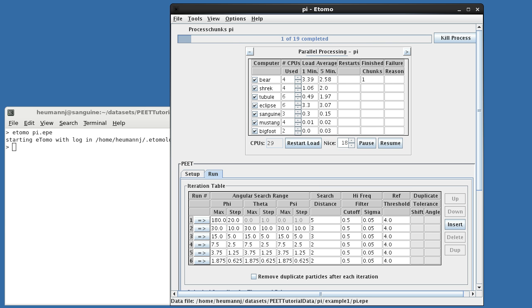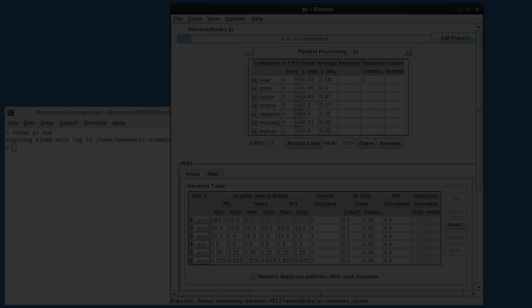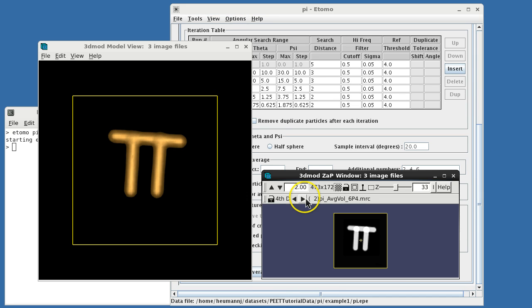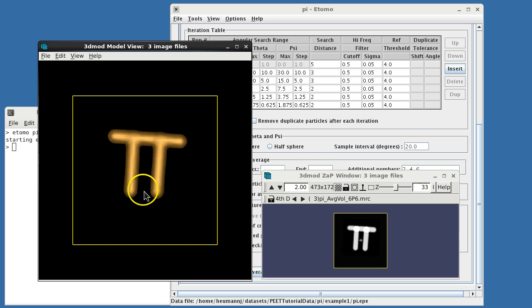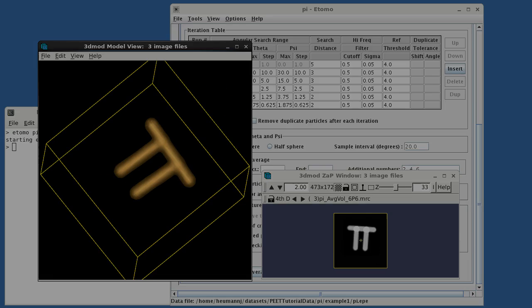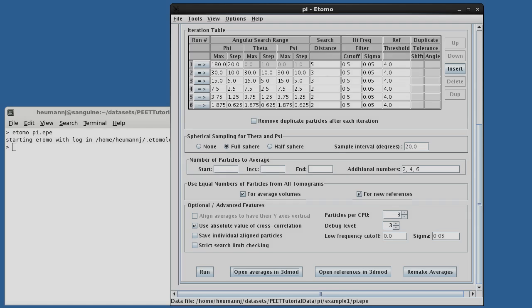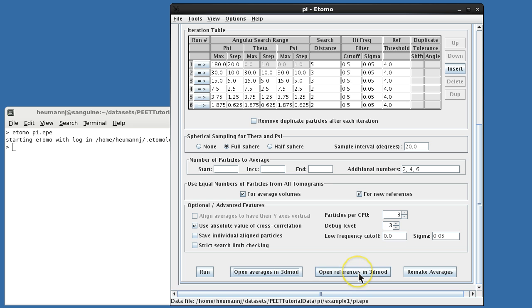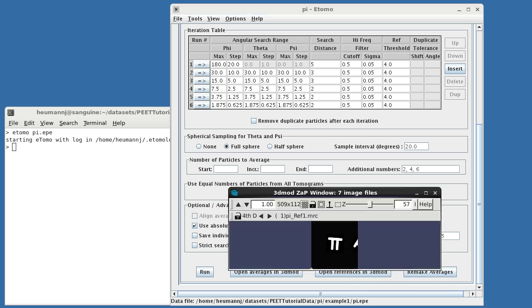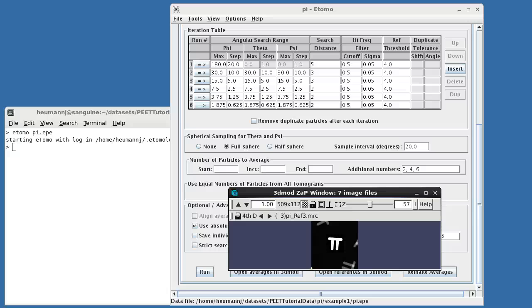After waiting for the processing to complete, we can examine our three averages in 3D Mod, and you'll see that they're perfect, as you'd expect for a toy dataset like this. We can also open the references used at the various iterations, and you'll notice a couple things. First, the reference volume is larger than the average.